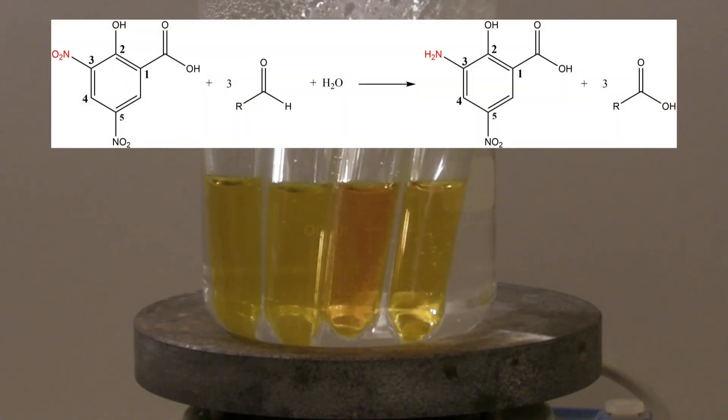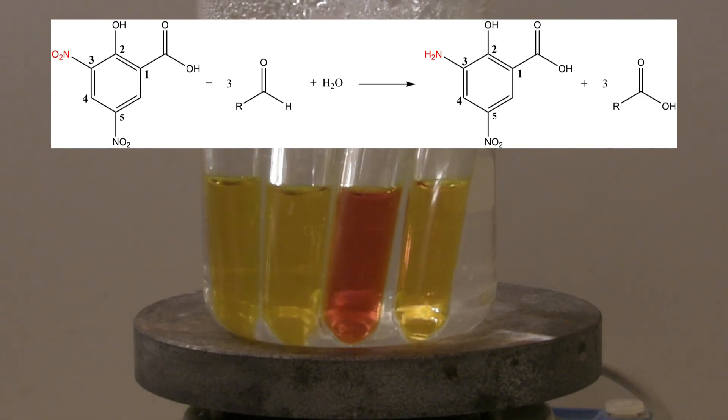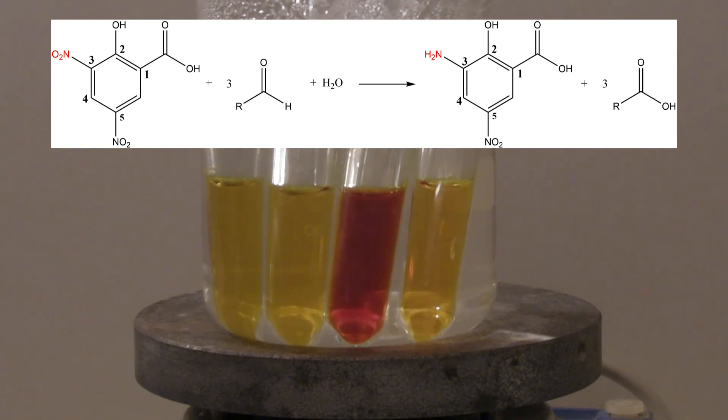The following reaction takes place. The nitro group on the third carbon is reduced to an amine group by reducing compounds. As an example for the latter, an aldehyde is used. The product is 3-amino-5-nitro-salicylic acid, which has a red color.